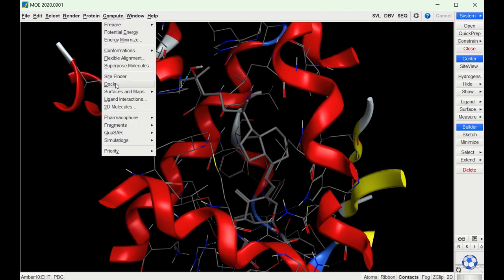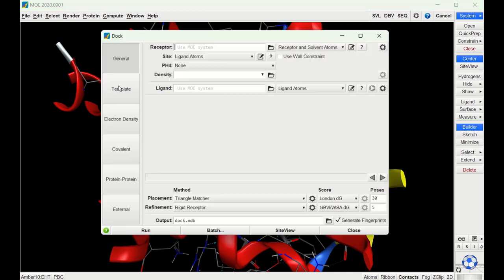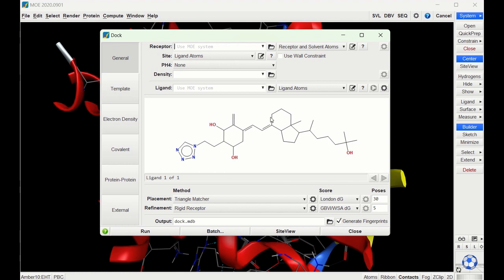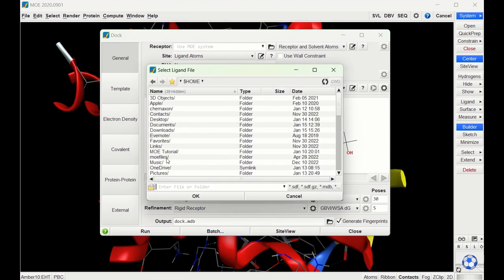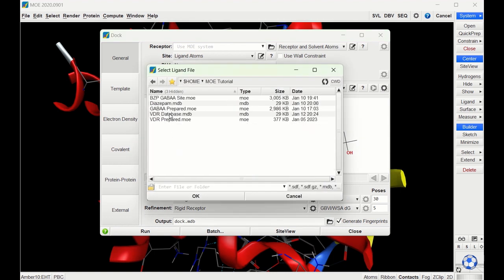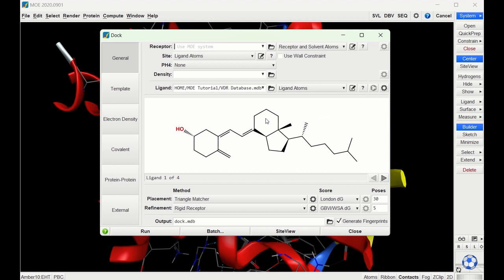To dock our ligands we go to Compute and Dock. Right now this is just showing the crystallized ligand that's in the receptor. PH4 stands for pharmacophore — we're not going to be using a pharmacophore right now, but a future video will cover that. Under Ligand we can choose the file icon, then choose our database, and now it's loaded in the ligands that it's going to dock.